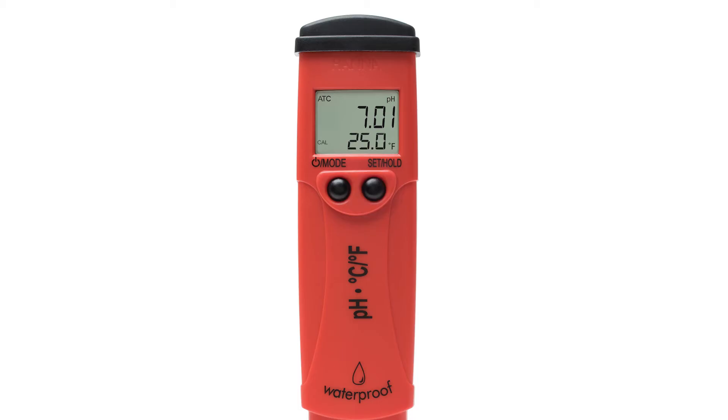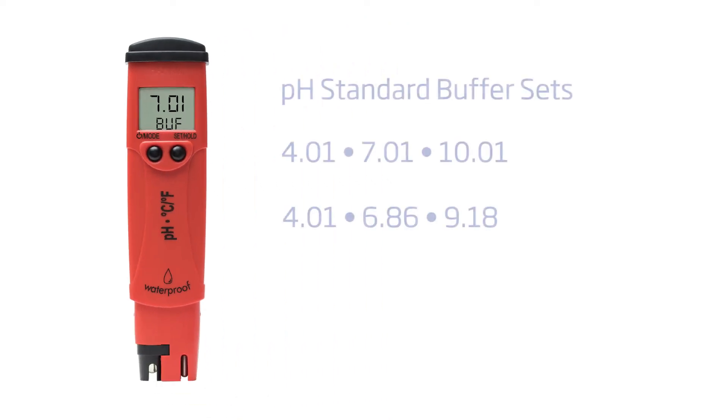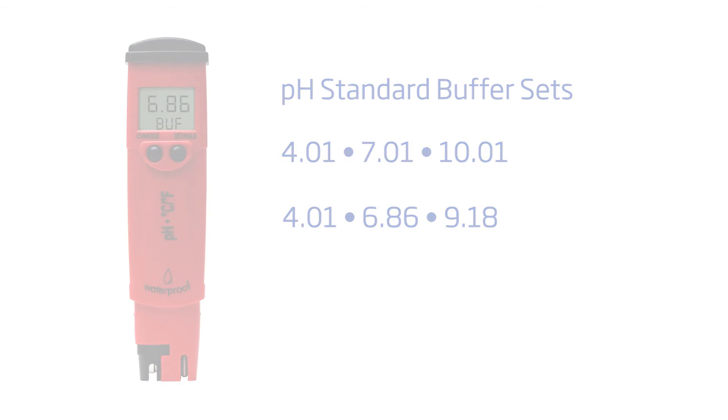Pressing the mode button again will allow you to change your calibration set. Your pH tester uses two sets of standard pH buffers. Depending on your application, you may use pH 4.01, 7.01, or 10.01, or you can use pH 4.01, 6.86, or 9.18 buffers.